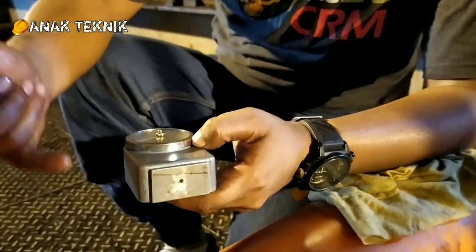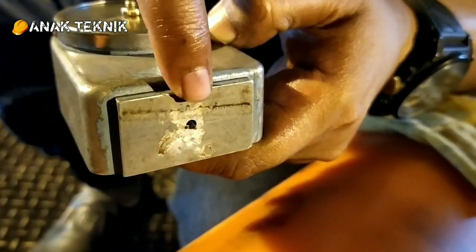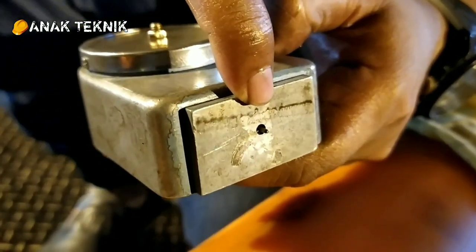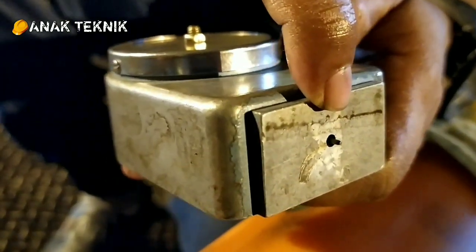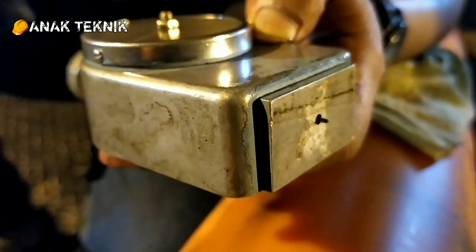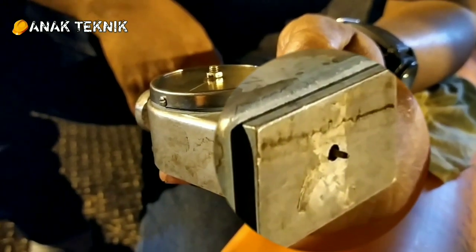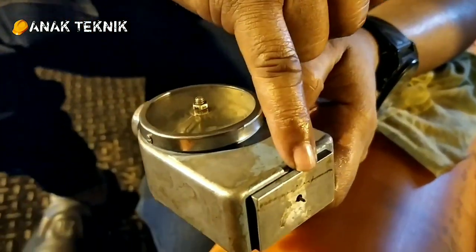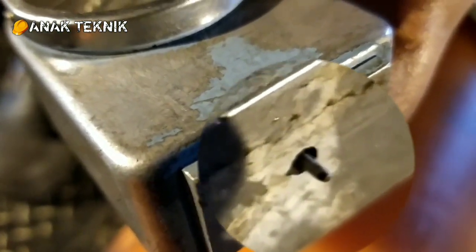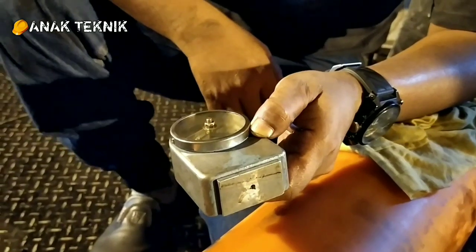Ada yang belum saya jelaskan. Jarum ini adalah yang membedakan Shore A atau Shore D. Kalau untuk Shore A, yang aplikasinya rubber dan poliuretan, dia agak tumpul, ada radiusnya di sini. Tapi kalau Shore D, itu pasti lancip. Kalau teman-teman beli di pasaran untuk pengukuran rubber, poliuretan, atau teflon, cari yang ujungnya tumpul. Jangan cari yang ujungnya lancip. Kalau ujungnya lancip, dipergunakan untuk Shore D atau untuk tingkat kekerasan lebih daripada rubber dan teflon.